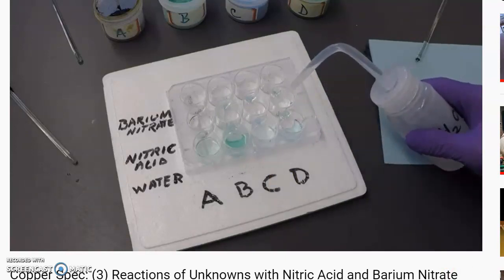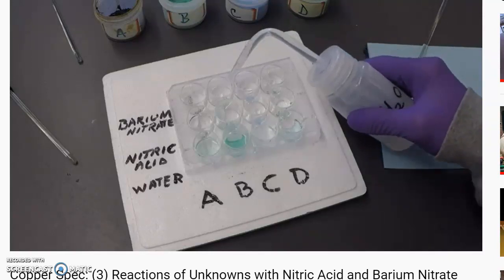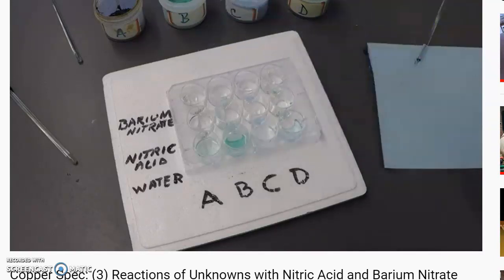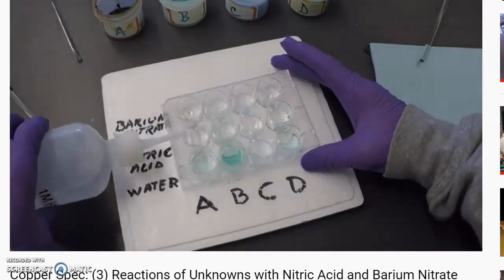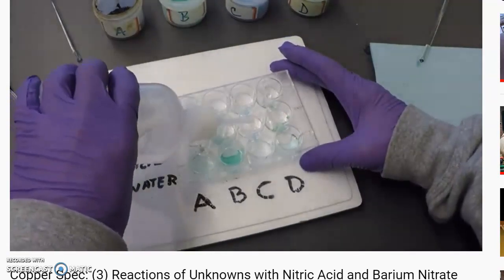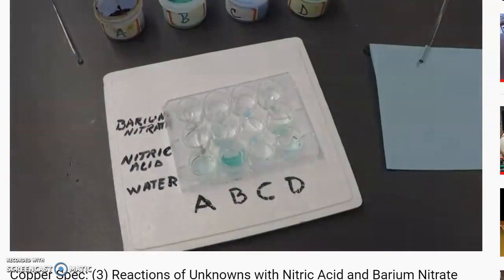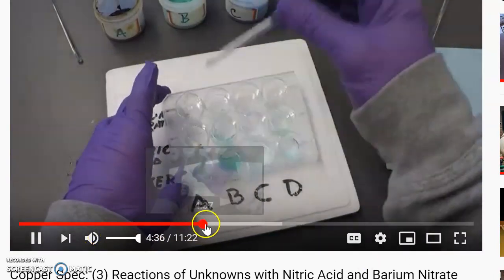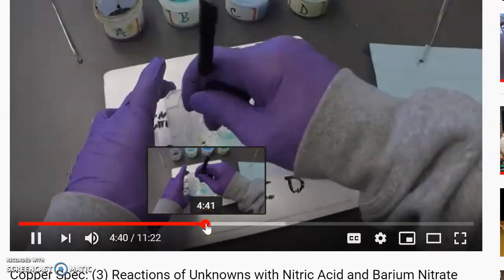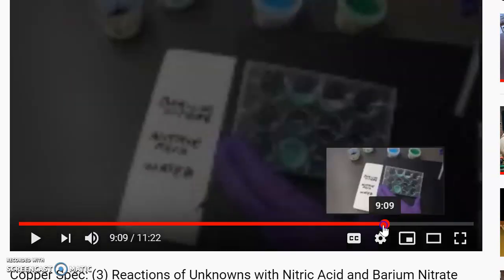And we're adding nitric acid. Nope, we're dissolving all of the rest of them in water. So we start out by dissolving them in water, so we have an aqueous solution. Of course, B isn't dissolved completely. And now once we dissolve them, we're adding in this case, nitric acid, and then we'll add barium nitrate to the other. I'm going to jump ahead to this image right here.